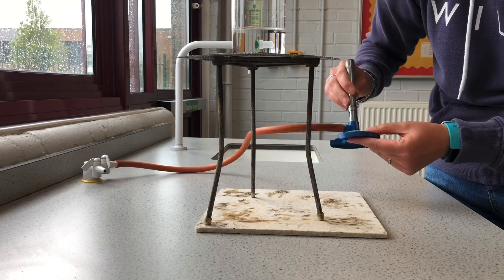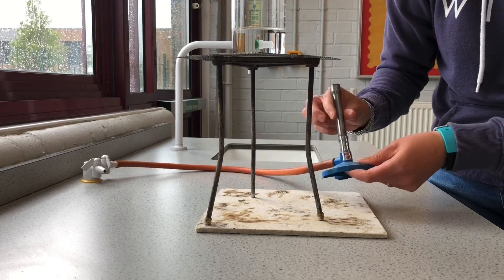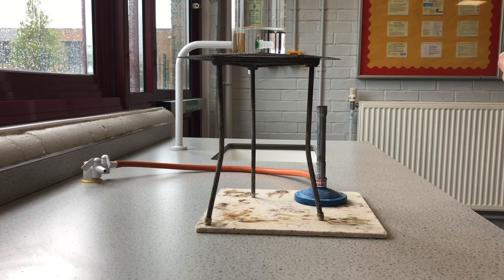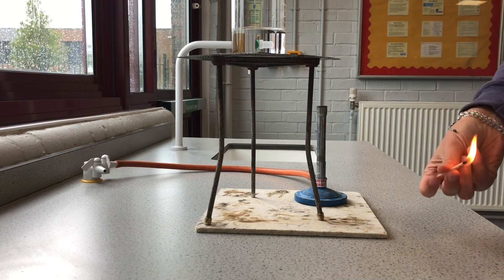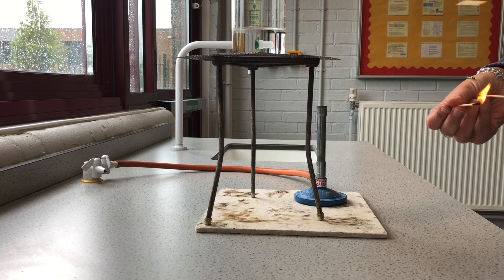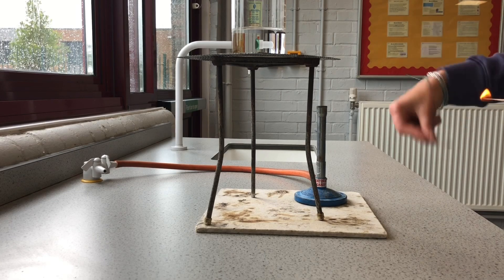We want to start with the air hole completely closed — that gives us a safety flame. What your teacher will do is light one Bunsen, and then you will light yours from that Bunsen.